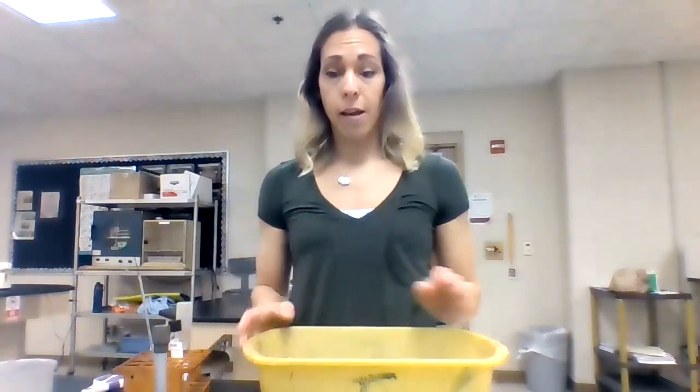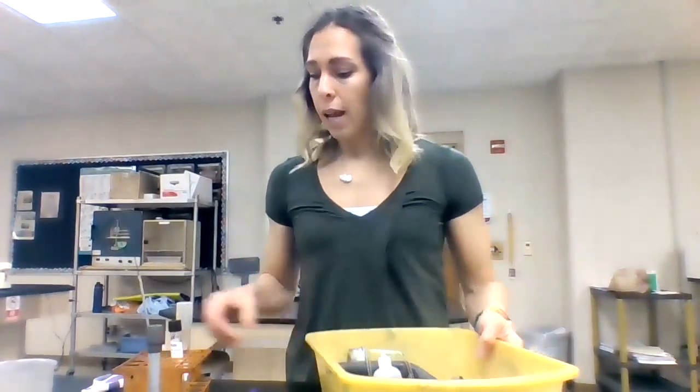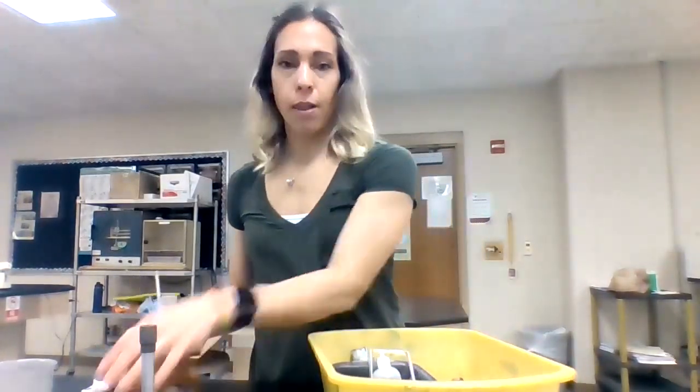I'm going to be showing you what we need to have in our microbiology lab bins. You have a bin — it's probably really gross looking, it's got a number on it, it's either going to be blue or yellow. And inside our bin, we need the following things.